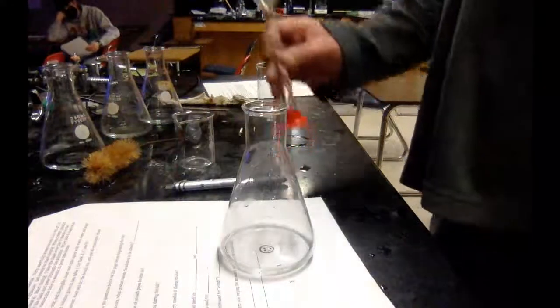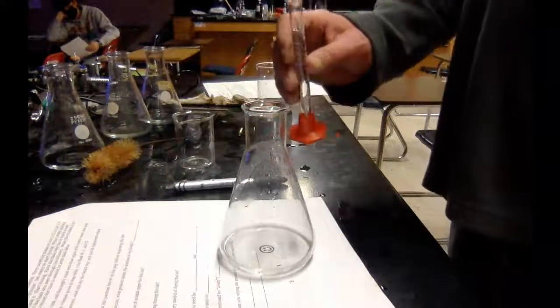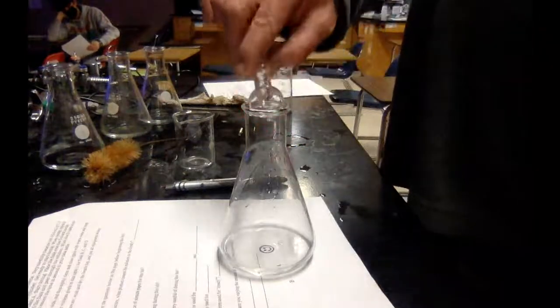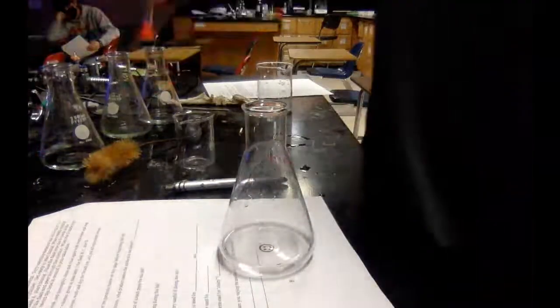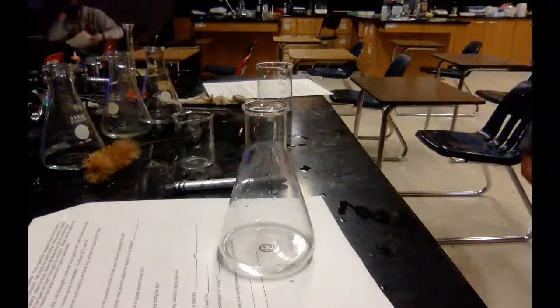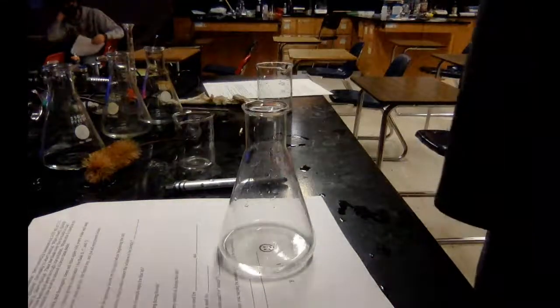And then you're going to add the HCl, and then you're going to start the timer. And then you're going to look down through there and watch that smiley face.